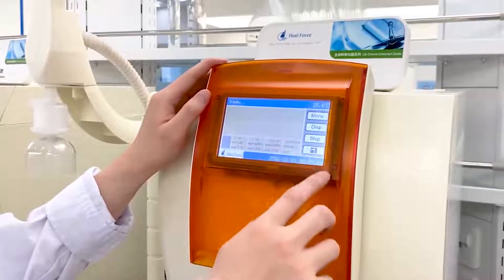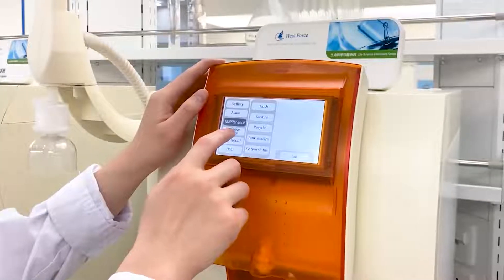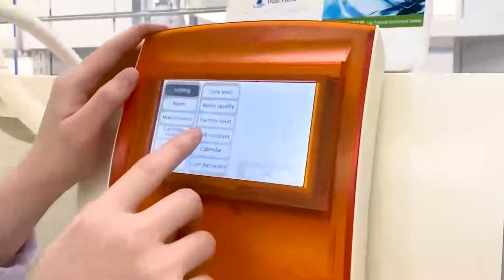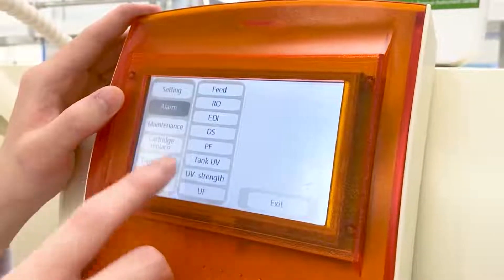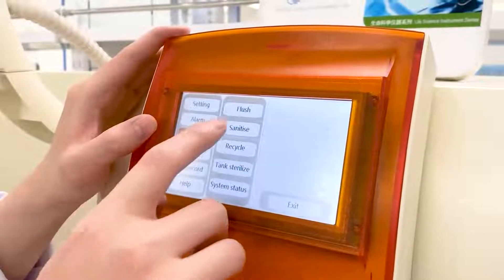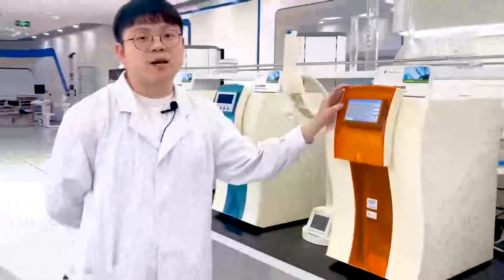There is a password lock. In the menu, we have: Setting, Alarm, Maintenance, Cartridge Replace, Data Record, and Help. Under Setting you have tank level, water quality, and factory reset. Under Alarm: feed water, outlet water, EDI, purification cartridge, tank UV, and so on. Under Maintenance: flush, recycle, and EDI. That covers the touch screen interface for the Smart Plus series.